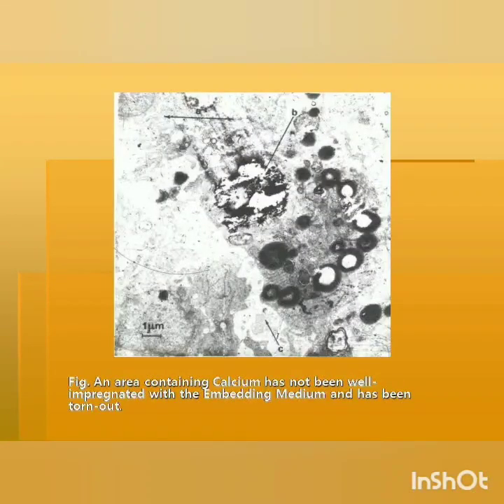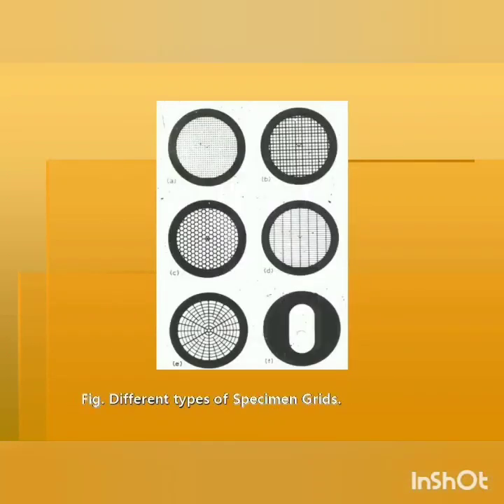This is the photograph showing an area containing calcium that has not been well impregnated with the embedding medium and has been torn out. So one has to take care about the elemental composition of the sample also while embedding it. Thus we could see that fixation can be used in different manner for different samples.